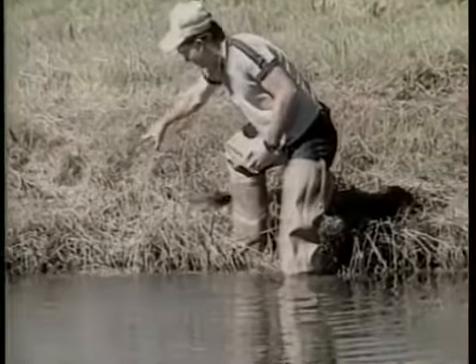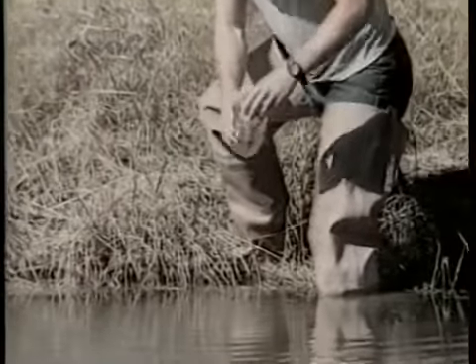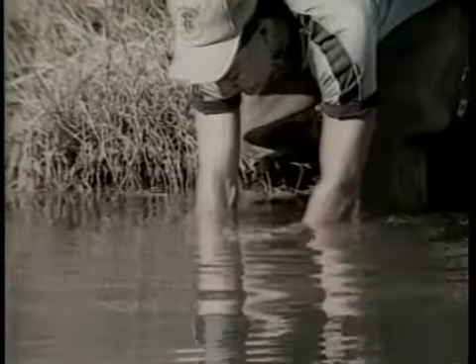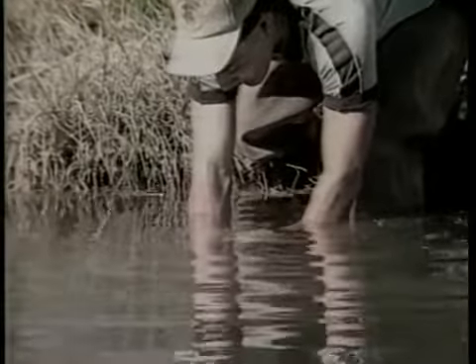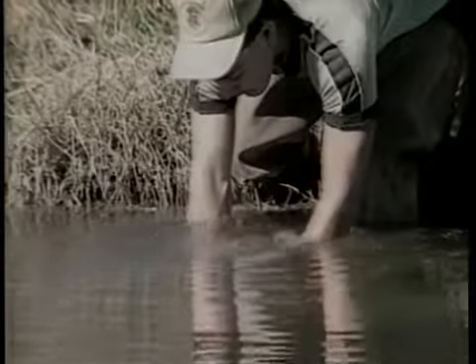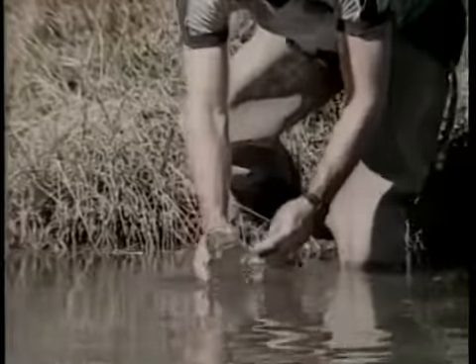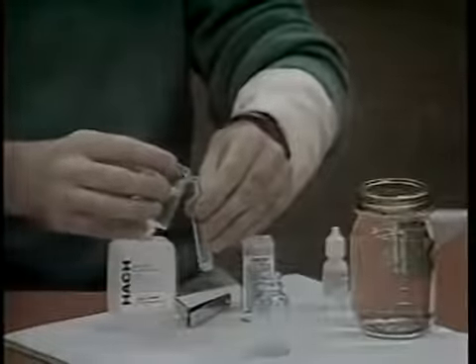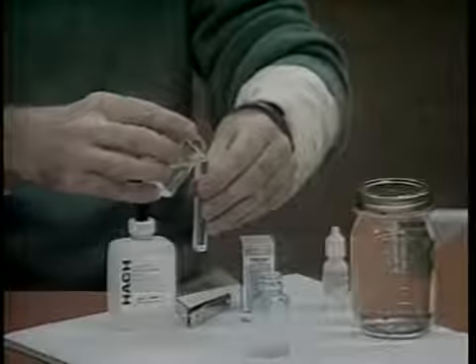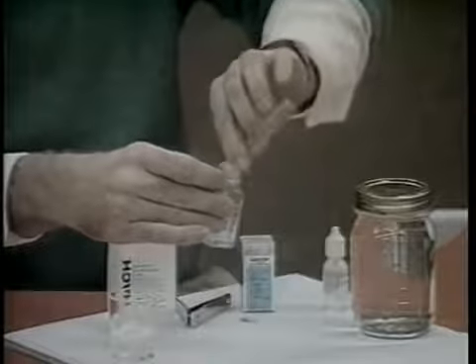First, obtain a sample of water to be tested. Water should be collected away from the pond bank if possible to ensure that stirred up mud will not influence the test. Water should also be collected using a clean container. It is very important to use clean containers to collect water samples, since residues in the jar or bottle may influence measurements. Once samples have been collected, rinse a plastic measuring tube provided in the kit with water to be tested. Pour the contents of this tube into the mixing bottle.